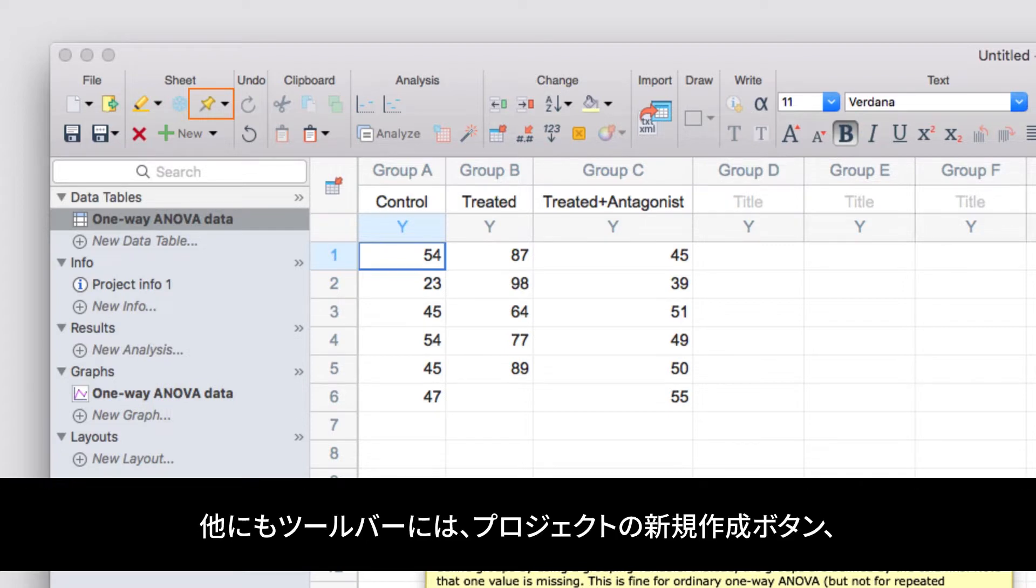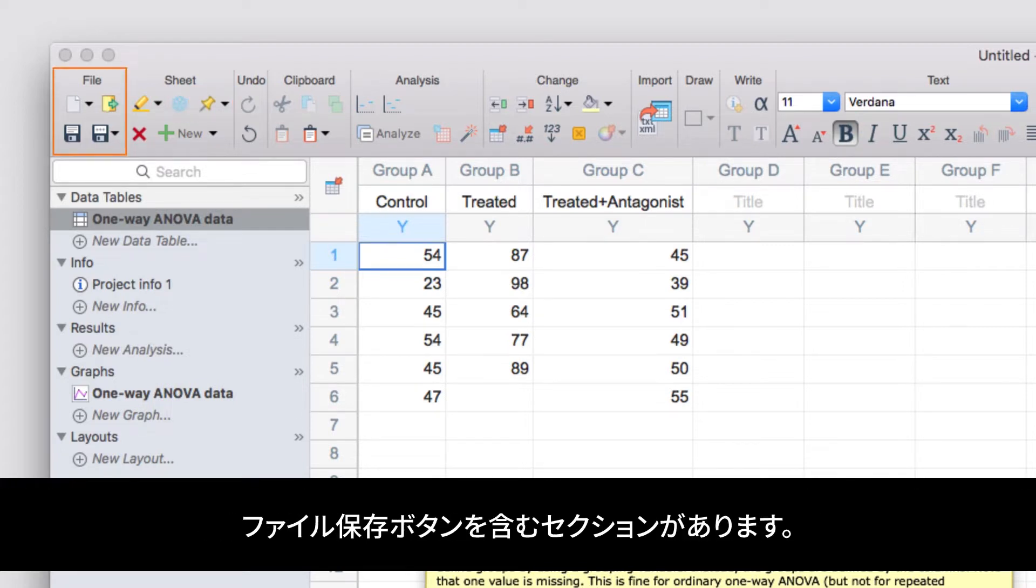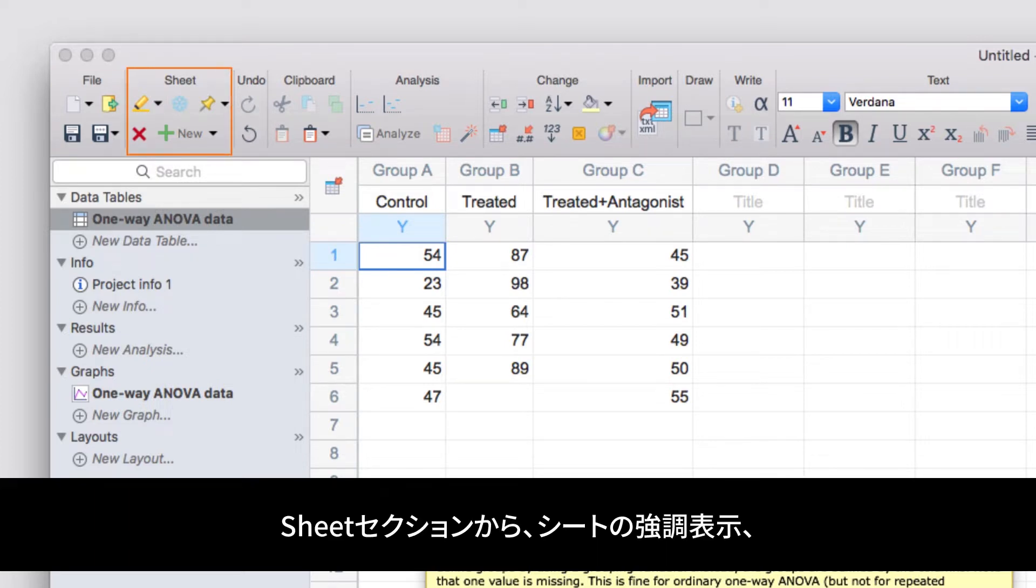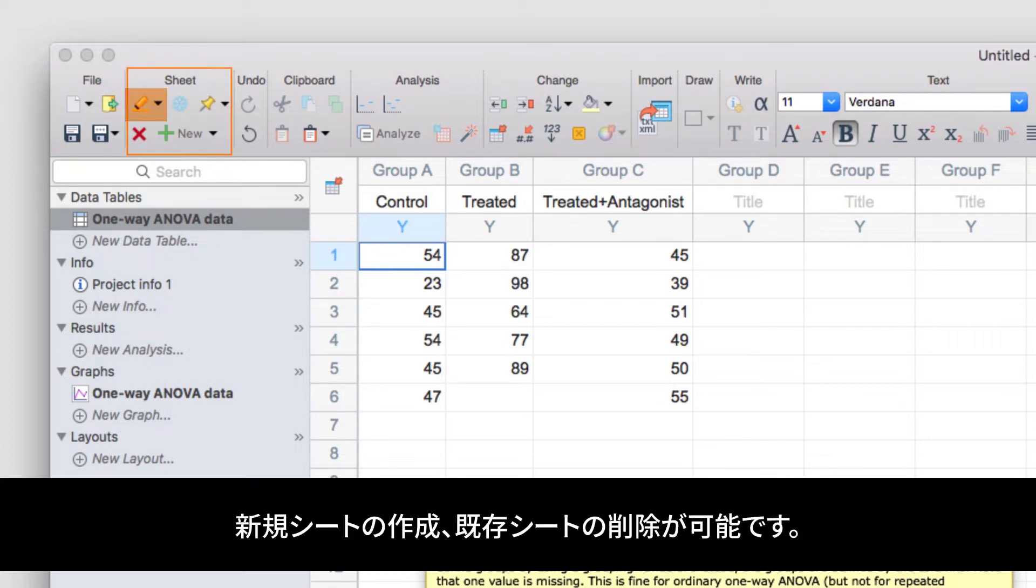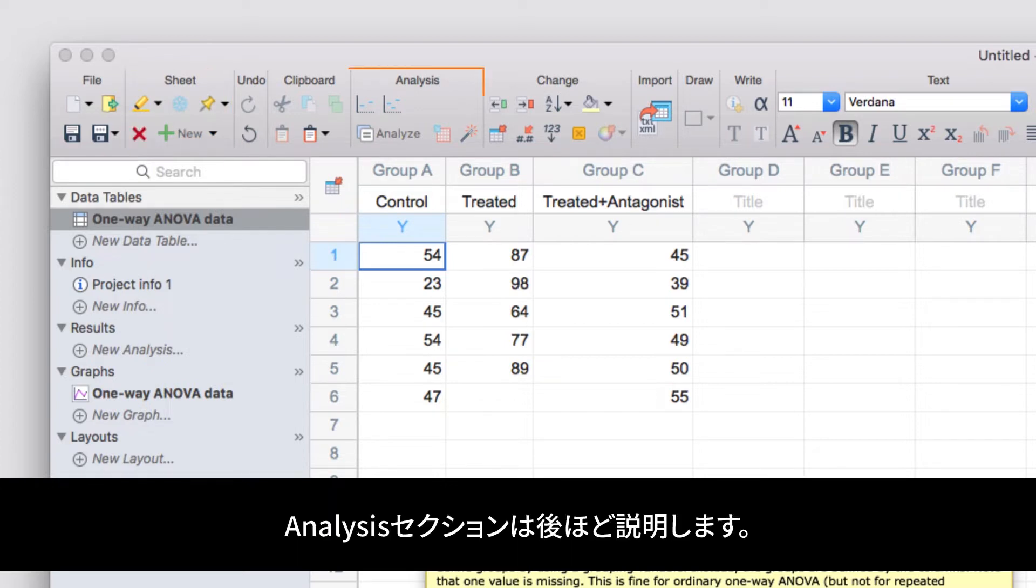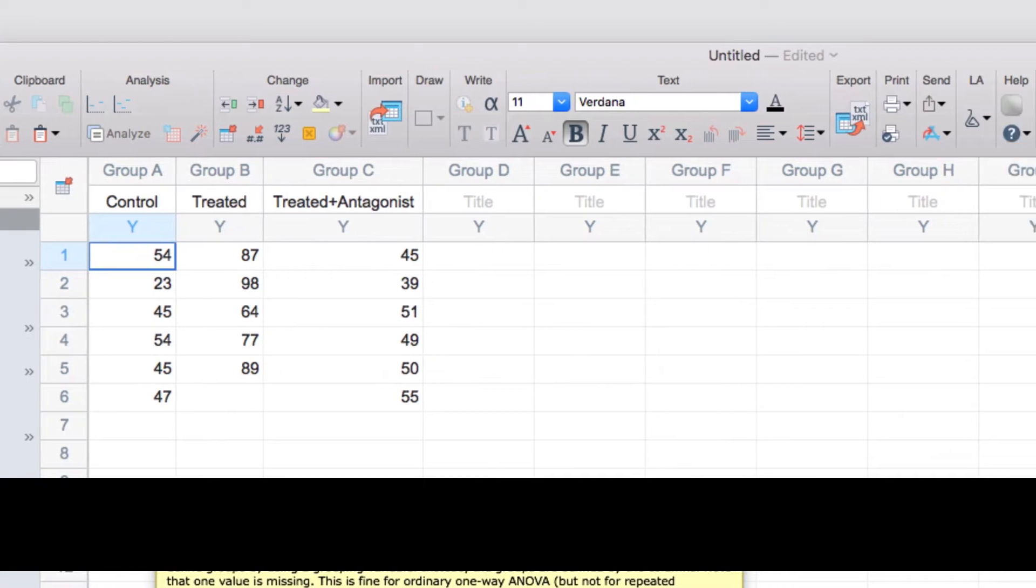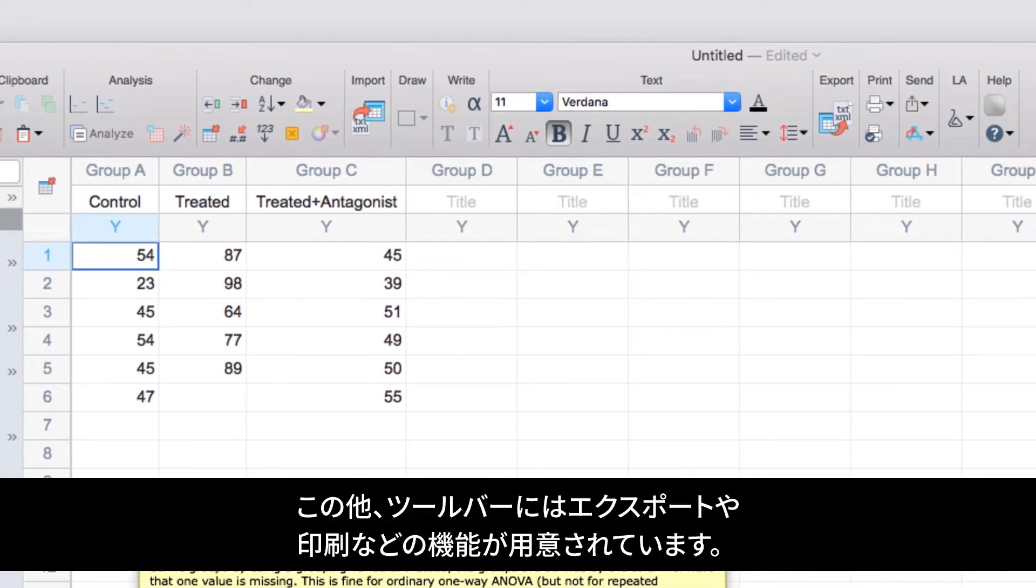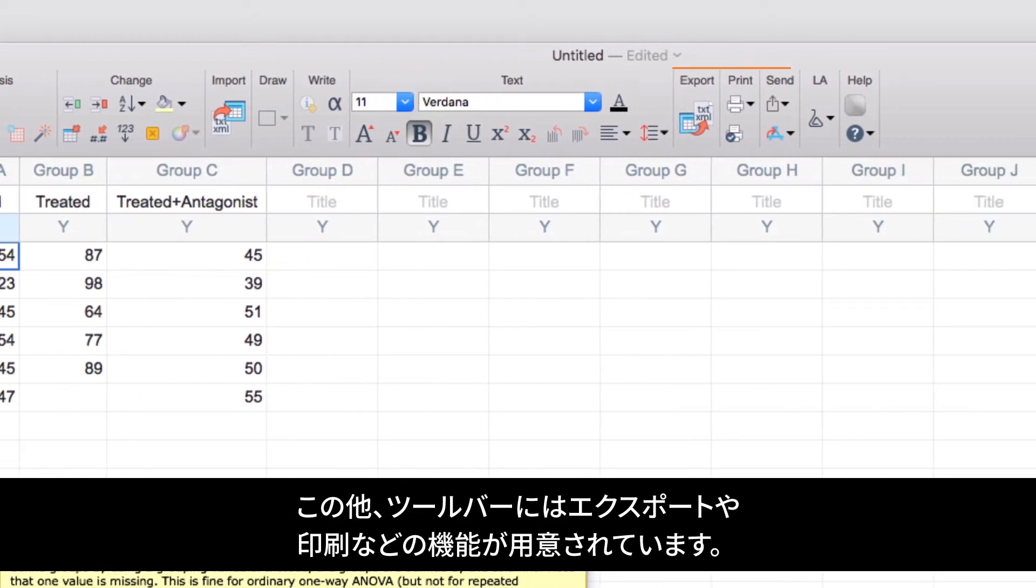Other important sections of the toolbar include the file section, where you can create new projects or save your work. In the sheet section, in addition to creating floating notes, you can highlight sheets, create new sheets, or delete existing sheets. The analysis section we'll come back to in just a moment. The draw, write, and text sections are mainly for customizing your graphs and layouts. And finally, there are a number of sections that allow you to export, print, and share your work.